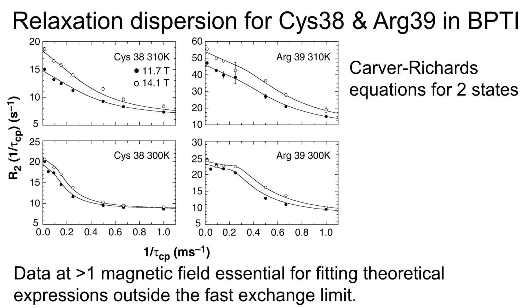And you'll notice that one can have quite peculiar looking relaxation dispersion curves. They're not monotonic. They can have some fine structure in them, particularly as the system moves towards the slow exchange limit. So the goal then is to measure the rate constant, vary tau CP, measure the rate constant again, and then hopefully fit the Carver-Richards equation if it's a 2-state process, or typically these days do a numerical analysis if one has to analyze more than 2 states.